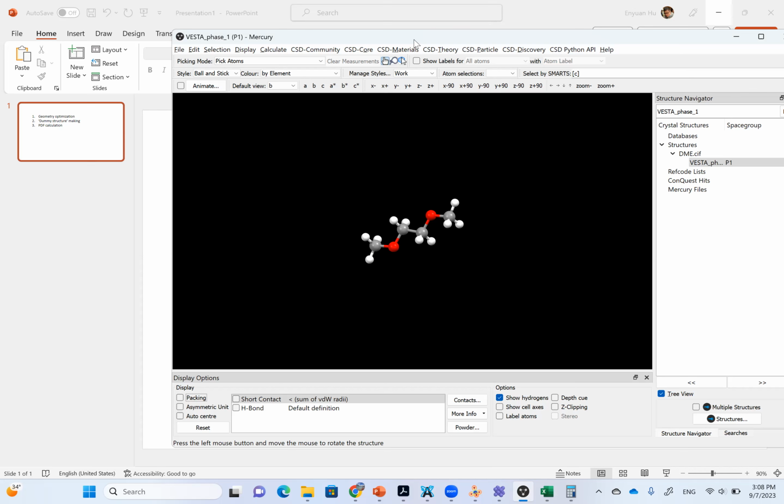Like this one is the big. You mean, I think you're talking about 2-theta, right? No, this one is actually the PDF, when I process through it. You think that in future we can have a Qmax of 40? No, I don't mean the meaningful data is still 40. I mean there's some random data after the 20 range. Random data? Just not meaningful data.